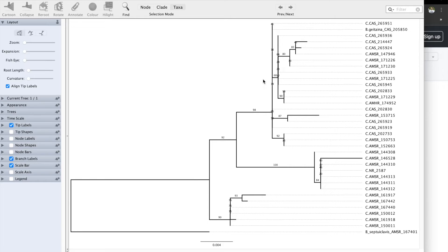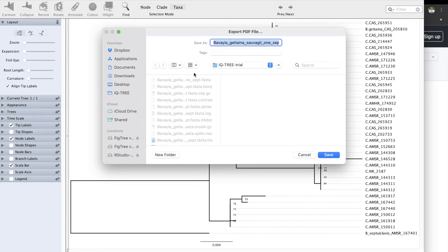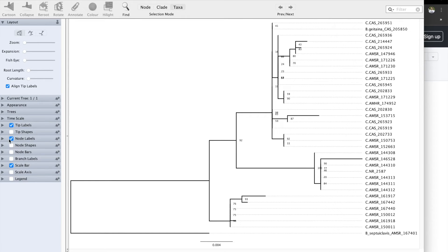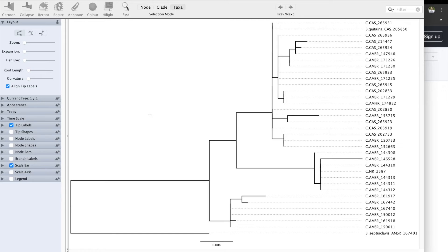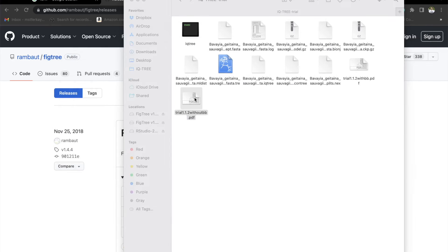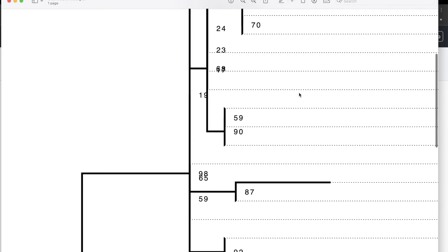At this point, we're having a little problem — these numbers are all together and don't look clear. So we're going to save two files: one with bootstrap values and one without. Let's save the one with bootstrap values first. Let's go to Export PDF. The reason we use PDF is because it keeps the resolution very high. Let's save it as trial 1.1.2 with BB, and let's save it again without BB as trial 1.1.2 without BB. Now we have two files, and the resolution stays really high.